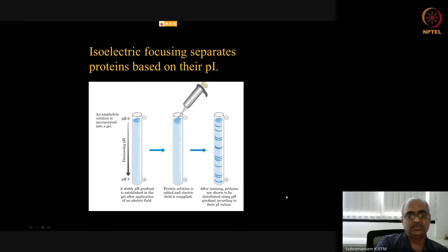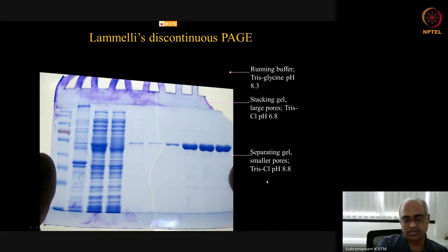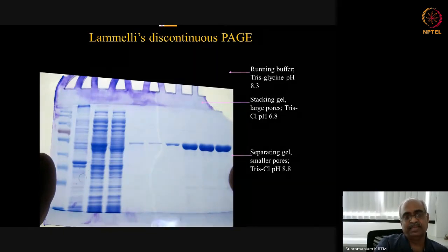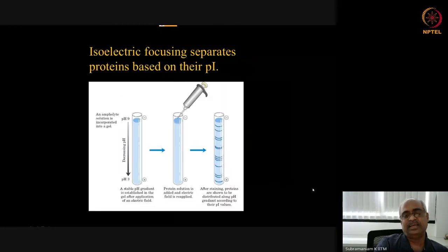So now, to circumvent this issue of not being able to separate all proteins, we exploit two distinct properties of proteins. Here we are exploiting the molecular weight differences among the proteins for separation. Then we already know, depending on the kind of amino acid sequence a protein has, its isoelectric pH can vary.